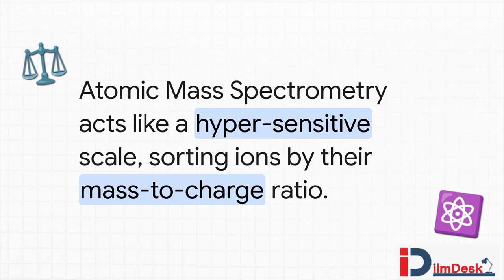Mass spectrometry is a whole different animal. Seriously, forget light for a minute. This is all about weight. The technique zaps atoms with an electrical charge which turns them into ions, and then it literally flings them through a magnetic field. Now, just like a heavy bowling ball is going to curve less than a light tennis ball, heavier ions bend less than lighter ones. By measuring exactly how much they bend, the machine can sort them perfectly by their mass. It's so precise it can even tell the difference between isotopes, heavier and lighter versions of the very same element.